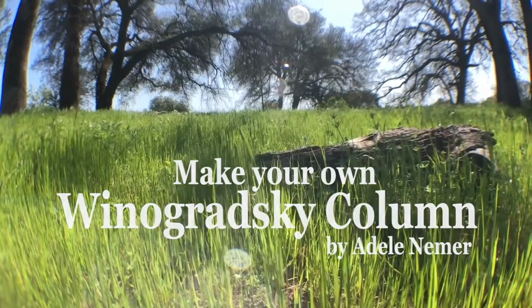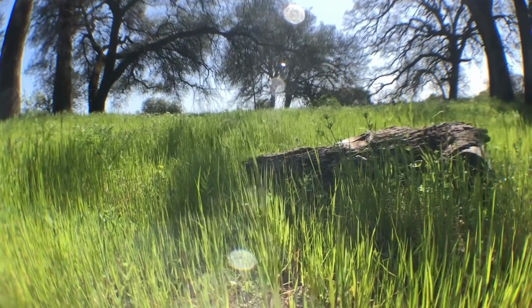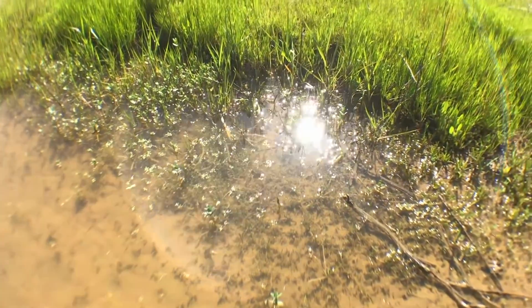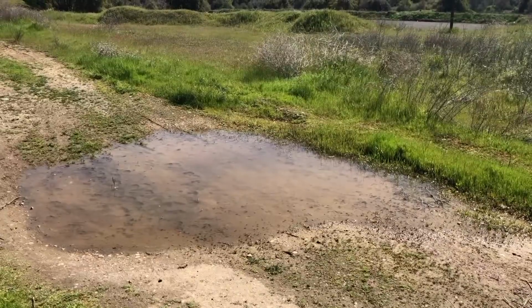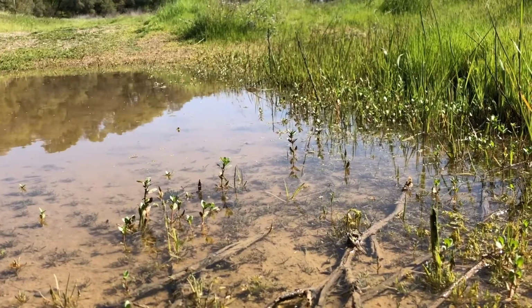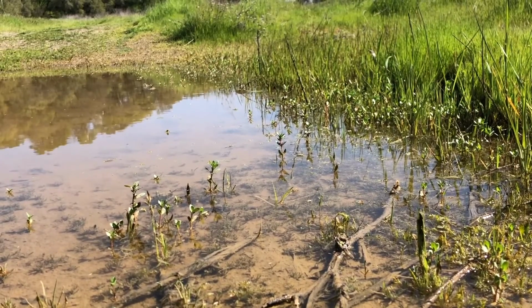Today, I'm going to show you how to make a Winogradsky column, named for the Russian scientist Sergei Winogradsky who invented the method. Building a Winogradsky column is a great way to observe microbial diversity in nature, and it is super easy so you can try it at home. The basic idea is to collect a mud sample and place it in a clear column like a plastic bottle for observation, and then watch the microbial life flourish over time.